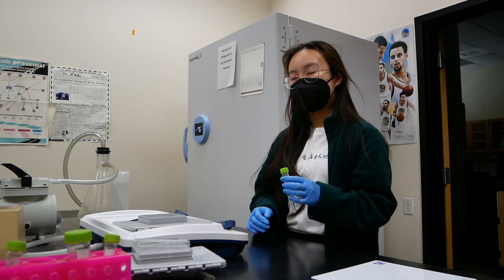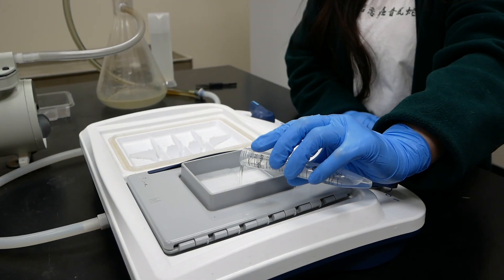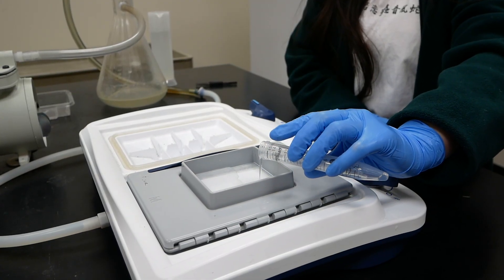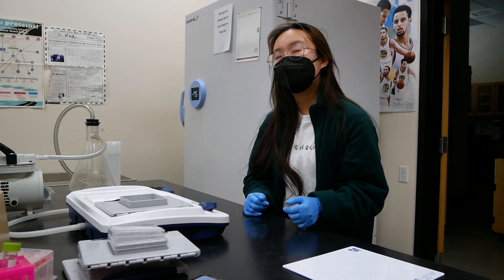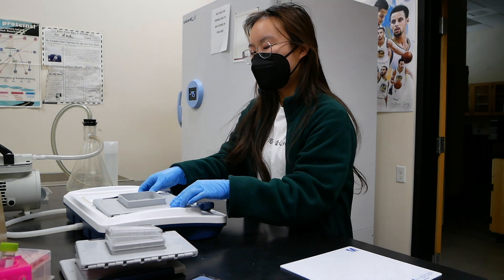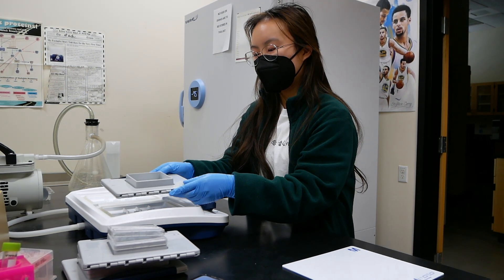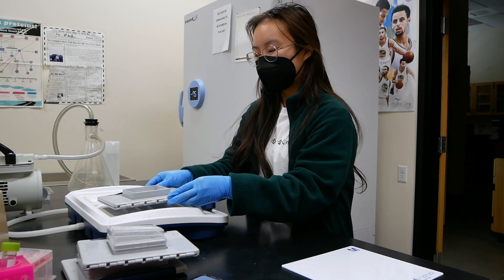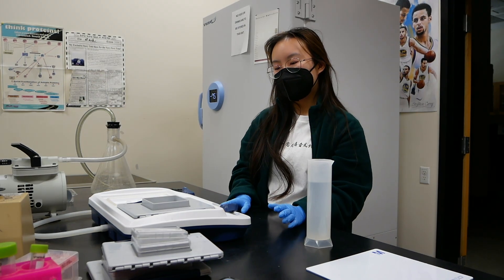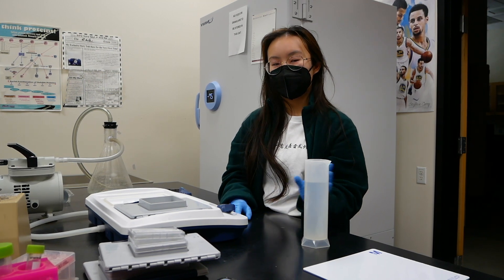Next we're going to add the primary antibody to the solution — drip it on carefully to ensure that all the proteins are covered. After adding the primary antibody, we're going to let it sit for 10 minutes. Halfway through, we're going to move the blot holder around to make sure it is evenly distributed over the proteins. After the 10 minutes is over, we're going to suction out the primary antibody and then wash it four times with the wash buffer.